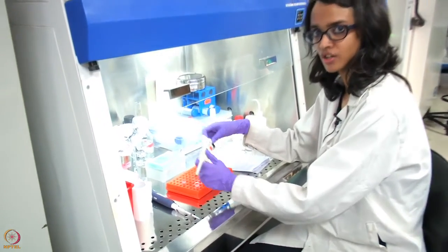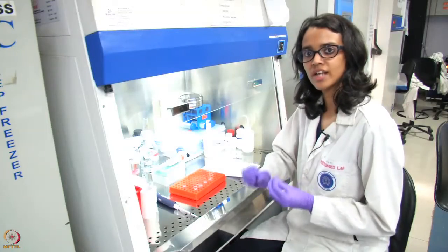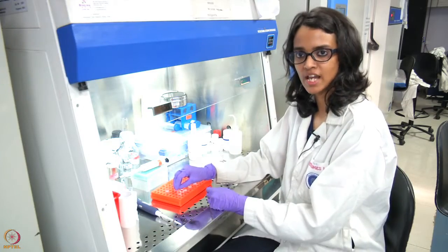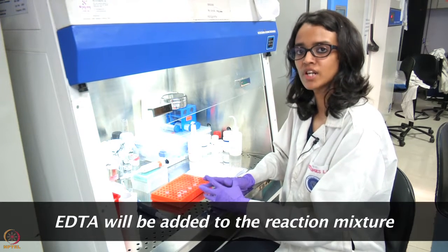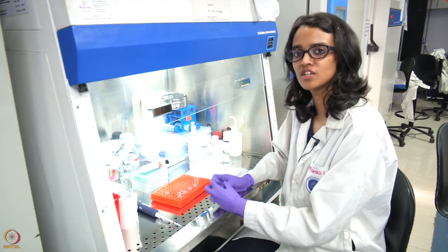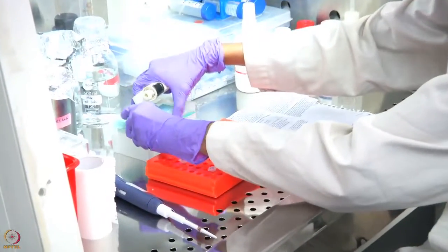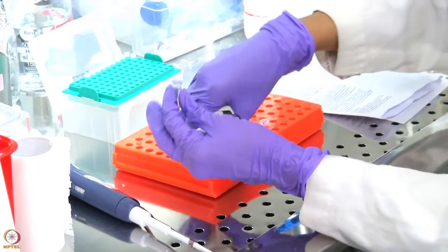After incubating the tubes at 37 degrees Celsius with DNase, we will then add 1 microlitre of 50 millimolar EDTA. EDTA will basically sequester all the divalent cations and prevent the RNA from hydrolyzing while heating at high temperature. We will now add 1 microlitre of 50 millimolar EDTA to our tube.